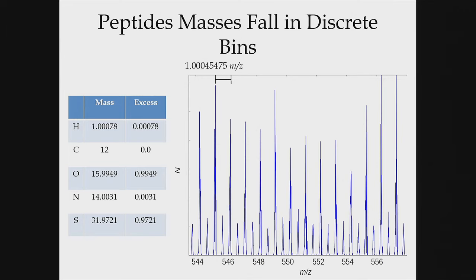So we can put these in intelligent places because luckily peptides' masses have this sort of distribution here, with what the Muddiman Lab has called forbidden zones in between. So this is a plot of if you took all of the potential fragment ions for a peptide, the singly and doubly charged fragment ions, and you plotted their distribution over mass to charge, what you would see is that there are particular places where you often see fragment ions, but there are these places where you never really see fragment ions.